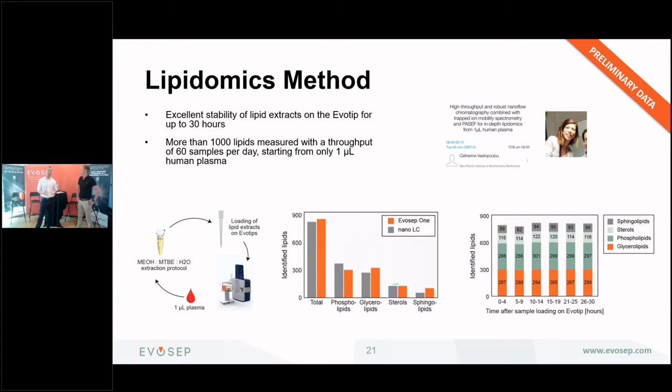And I think in this field, it holds so much potential, especially going to the clinic, looking at lipids from plasma, from urine. I think it's one of the applications that really benefits from standardization, because it's not easy to work with these. And if there is a way to more easily measure what's in your body fluid, that will be a benefit.